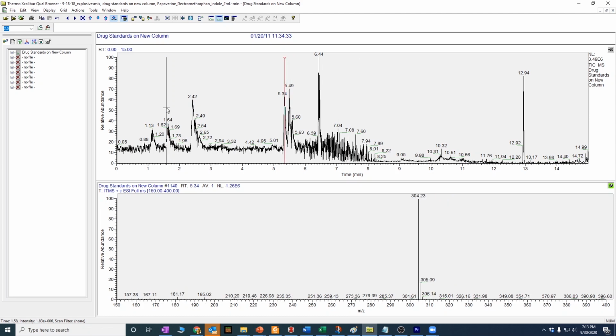Okay, so first of all, let's clean this spectrum up a little bit. If we look at the y-axis here, mass spectrometry is a little bit different because we always normalize the spectrum. They take the tallest peak and call it 100%, and then they show you the relative abundance. That's the nomenclature, what's standard in mass spectrometry. It's a little bit different. They take the tallest peak, call it 100, and then put everything relative to that tallest peak.